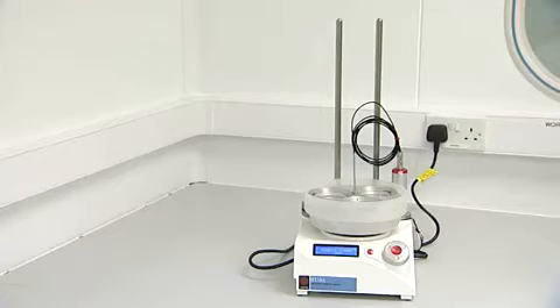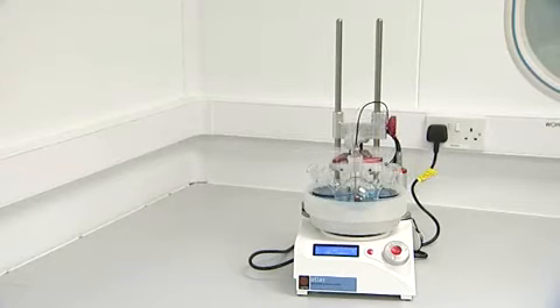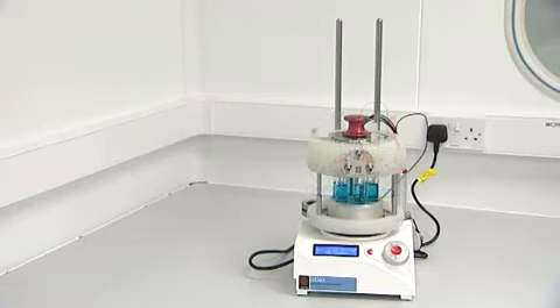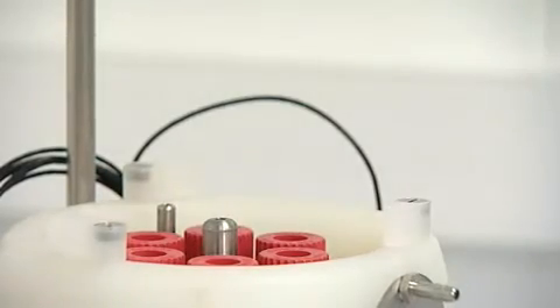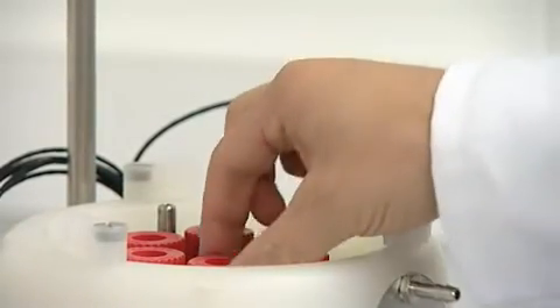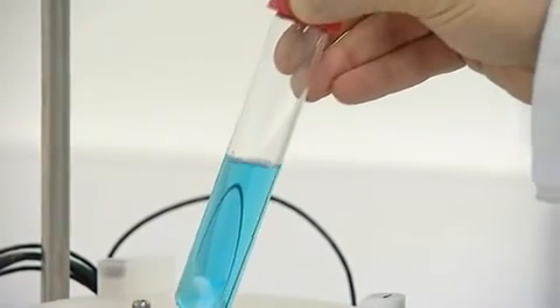For parallel flasks, the stacking dry bath can be substituted for a triple bath. And for parallel vials or reaction tubes, it can be replaced with vial baths or orbit systems, if reflux or inert conditions are required. Available for six 45 ml tubes or 12 10 ml tubes, the orbit systems offer efficient parallel chemistry with easy access to reaction tubes.